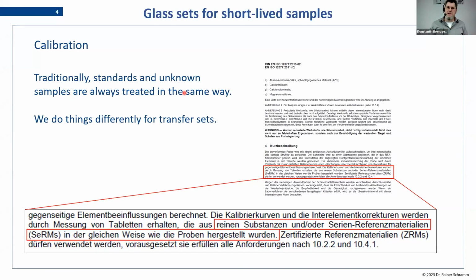This is something that we will not do with our transfer sets, and I'll explain in a bit more detail why not and what will be the difference.